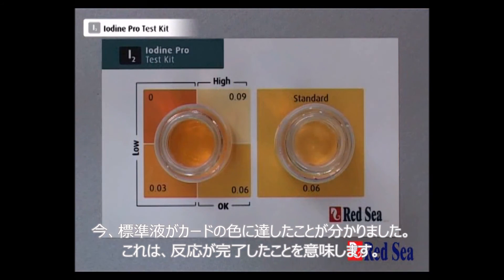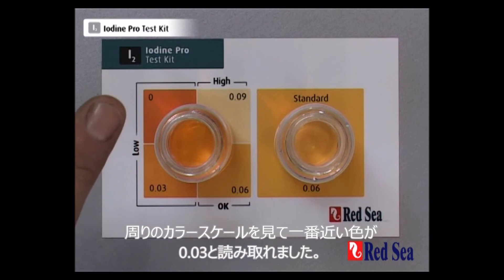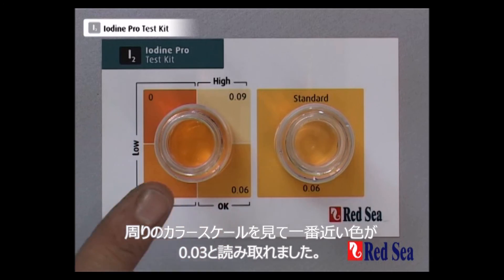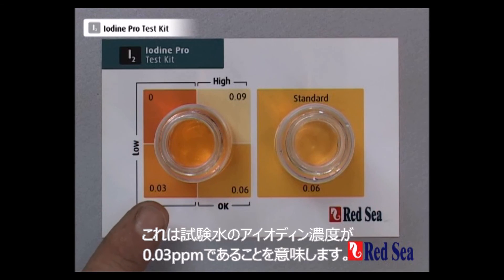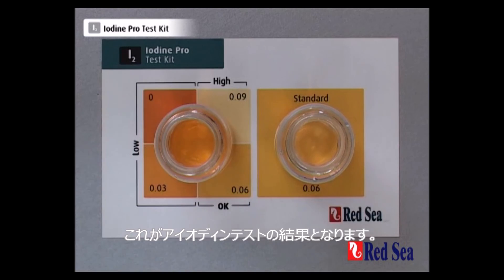We can now see that the color in the standard vial has reached the color on the card, which means that the reaction has now completed. When we look at the test vial and compare it to the color scale, the closest match is 0.03, which means that we have 0.03 ppm of iodine in our water sample. That is the end of the iodine test.